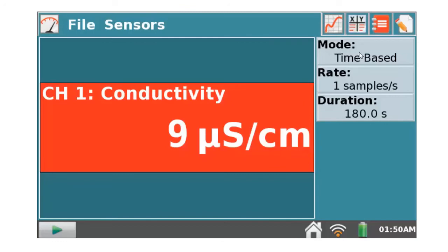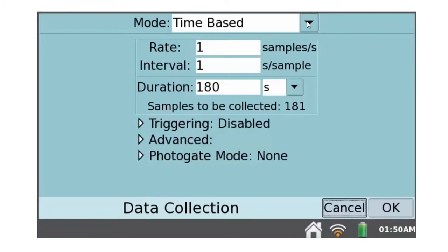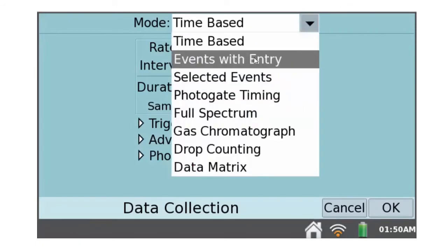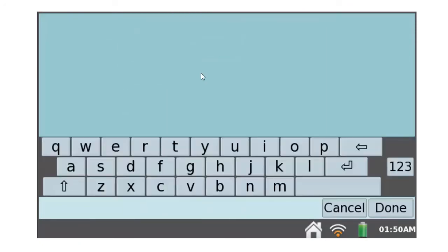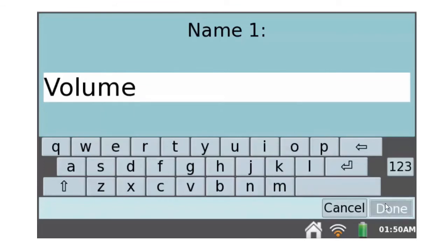I'm going to hit the time-based thing up in the upper right-hand corner. I'm just going to let it run. Hit this up here, you get this screen. Up here you can hit the drop-down, it goes to events with entry. Then you're going to type in the name for whatever this is going to be. Volume, whatever it will be inside of here. Just put in the volume and that's fine.